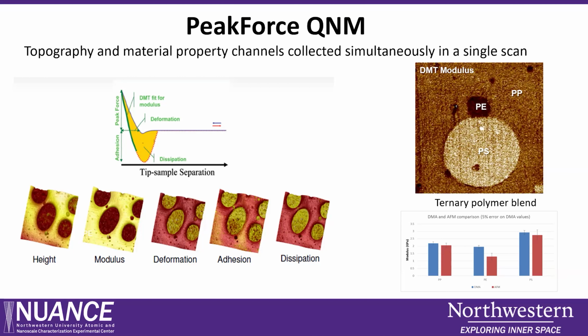This type of technique is very useful, especially if you have monolayers or very thin films that you cannot go for a bulk indentation. Bulk indentation has certain limitations, in that you cannot indent pretty close to the surface. There's a certain criterion there to minimize the substrate effect. But this technique is very powerful. So you can have some monolayers or some nanoparticles on the surfaces. You cannot eliminate the substrate effect completely, but you can try to avoid some of it in your modulus calculations.